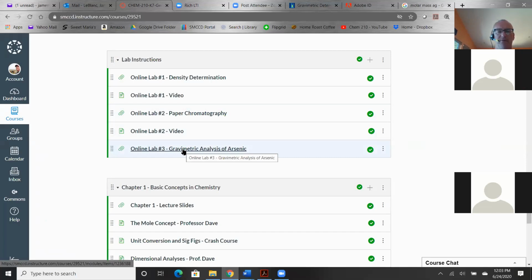Online lab number 3. Gravimetric analysis of arsenic. Yummy arsenic.